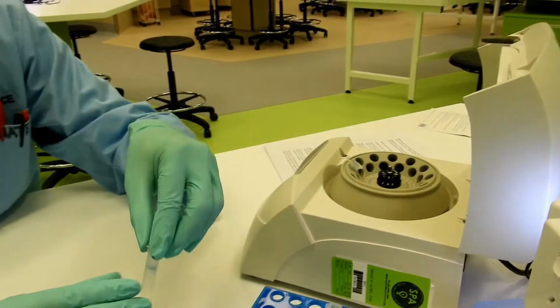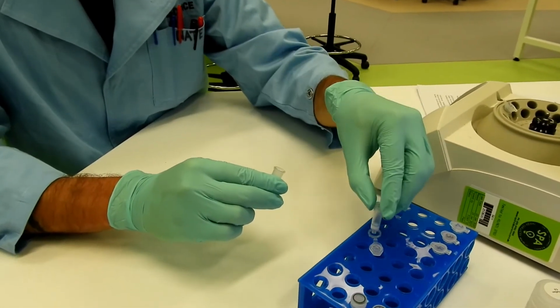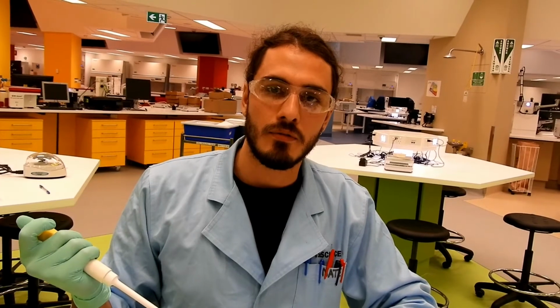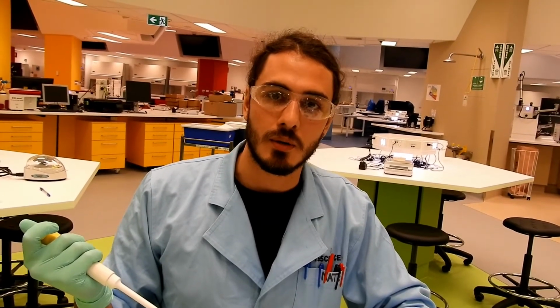We'll now place the filter into a fresh Eppendorf tube. We want to be careful not to splash any of the residual ethanol that's in the bottom of the collection tube onto our sample. Finally, we'll need to elute the DNA from the filter into a collection tube so it can be used for downstream processes such as PCR.